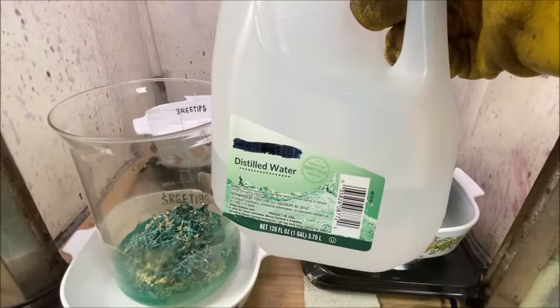I'm going to turn the stir bar on, add a little bit of heat, and now I'm gonna shoot some nitric acid in here. And we're gonna start dissolving these gold foils with some aqua regia. The foils are very thin, should dissolve fairly quickly. Let's pull this down off the heat now.